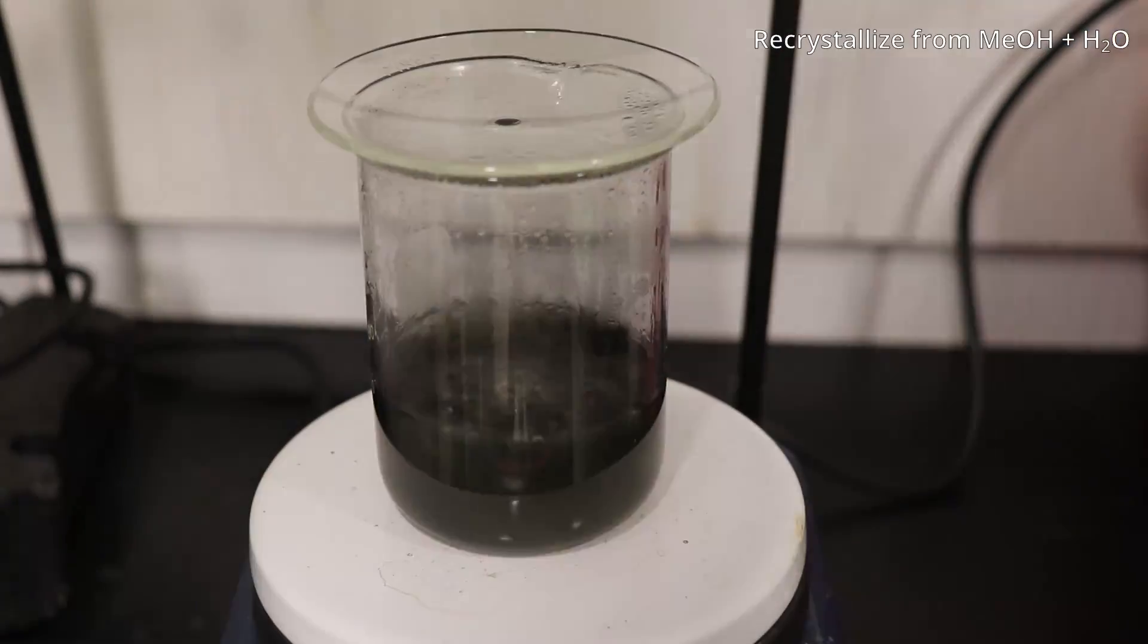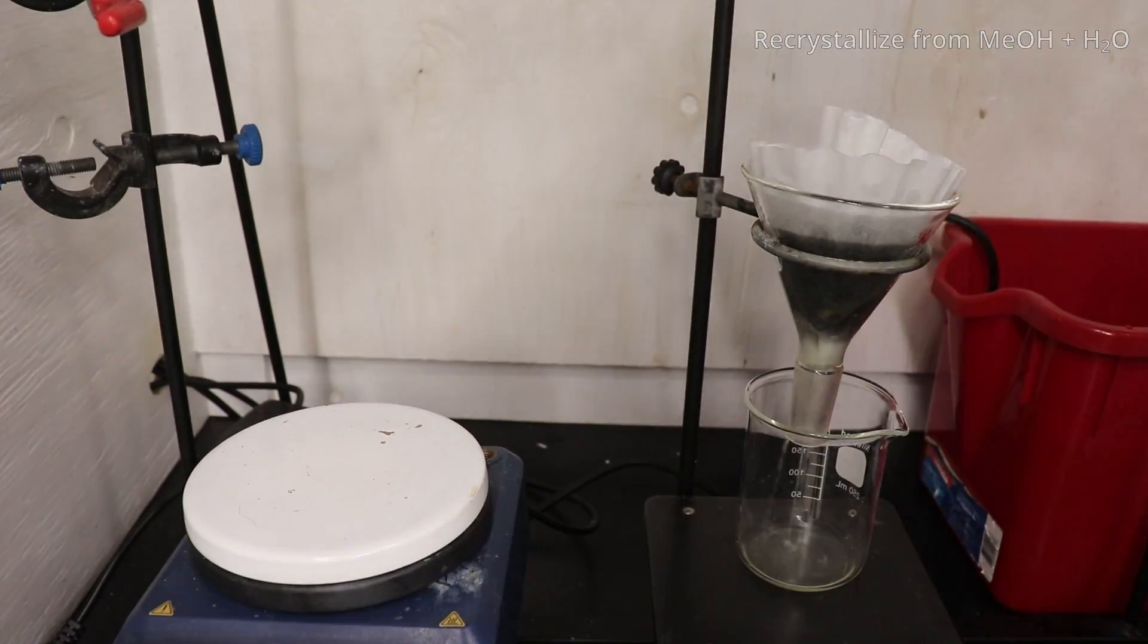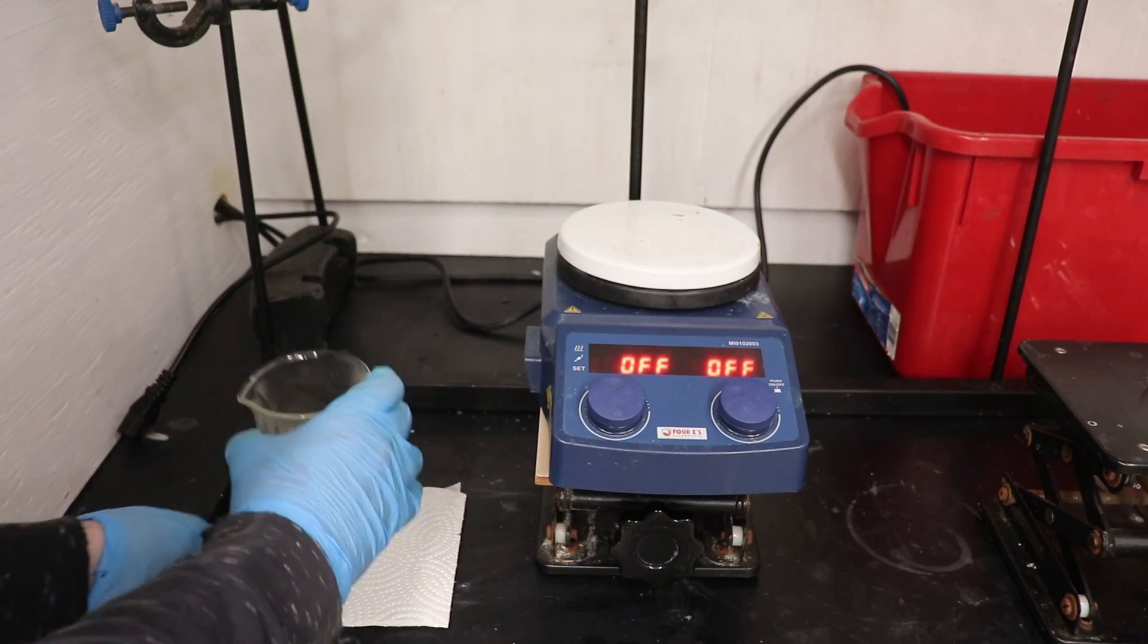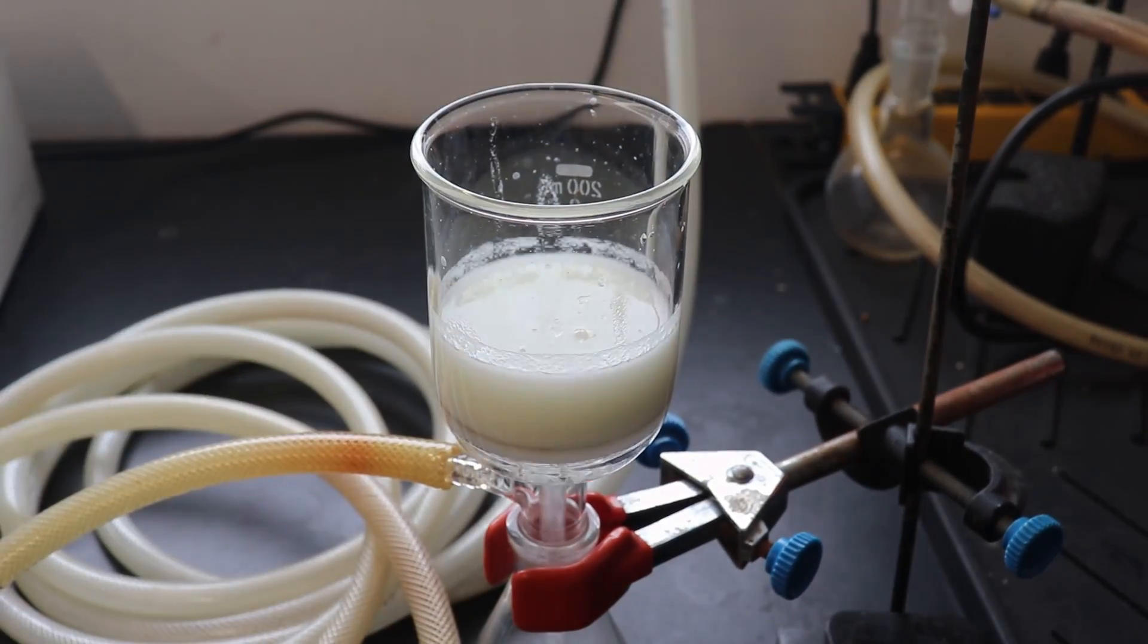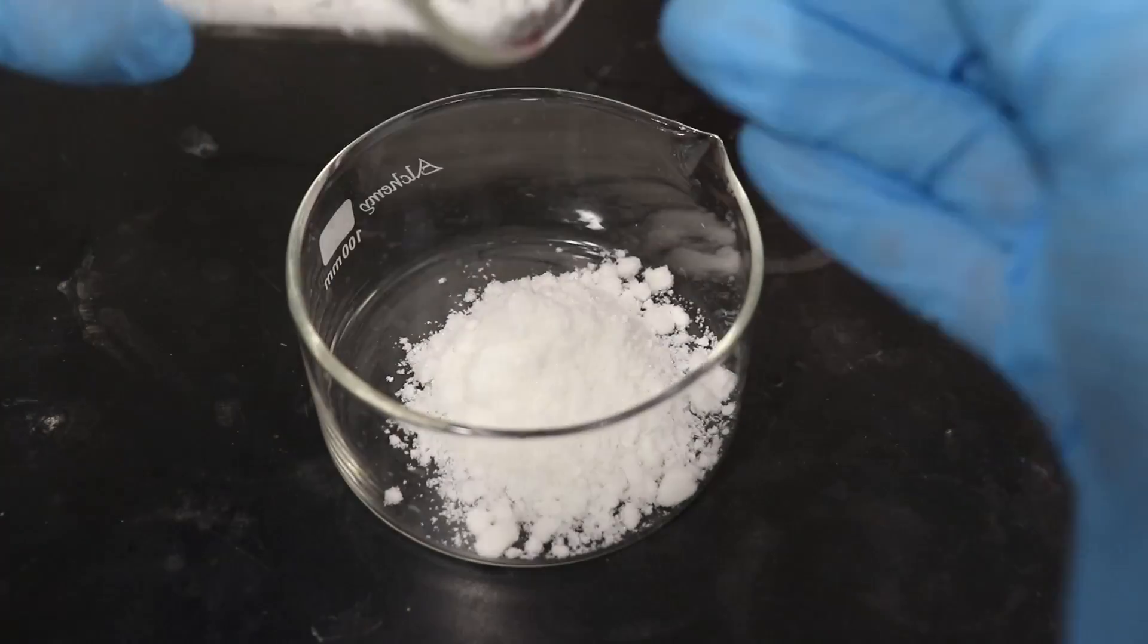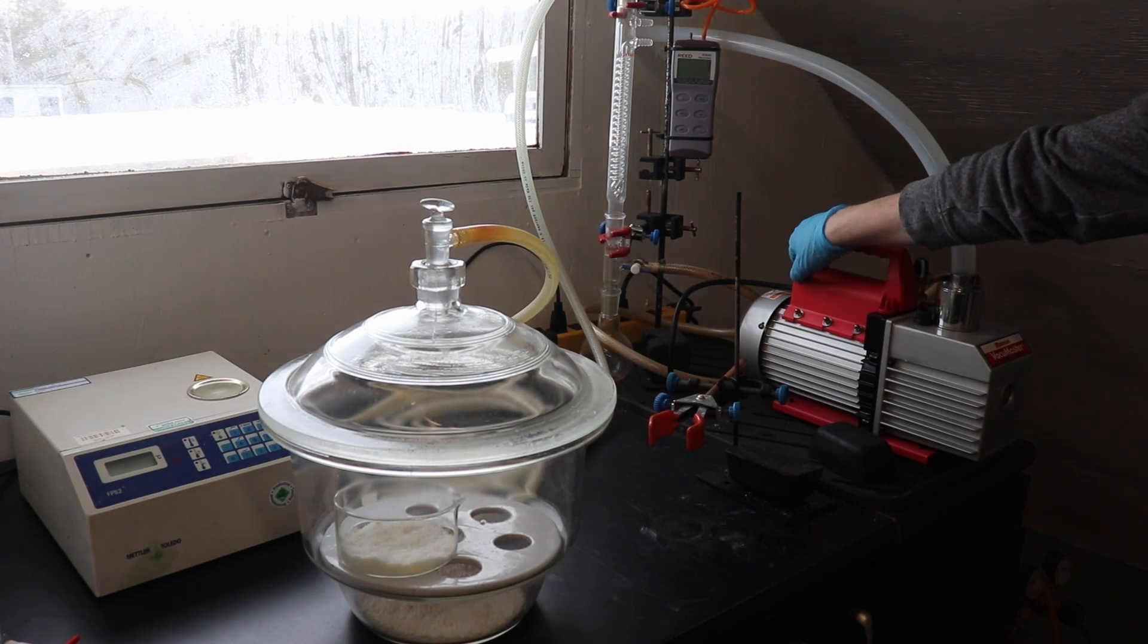The biphenyl was recrystallized from methanol and water, and activated charcoal was added to decolorize the solution. It was then hot filtered and allowed to slowly cool down to room temperature, and then placed in the freezer to cool overnight. The biphenyl was then vacuum filtered off and dried in a vacuum desiccator with calcium chloride overnight.